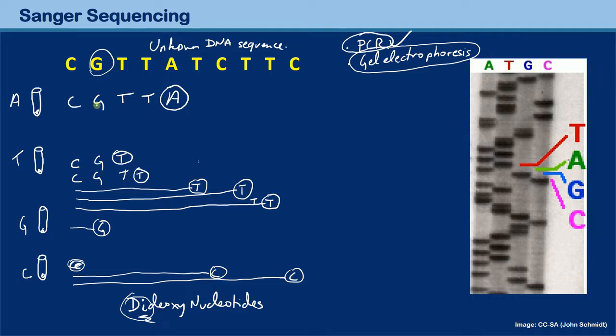So what I do is I take the DNA over here in this tube, and I put it into this slot here at the top. There's a little slot, a little hole, and I put the mixture in here. When I apply a negative voltage over here and a positive voltage down here, the DNA will move from the negative voltage to the positive. There's a wire over here with a negative voltage, and the DNA is also negative, so negatives and negatives repel each other.